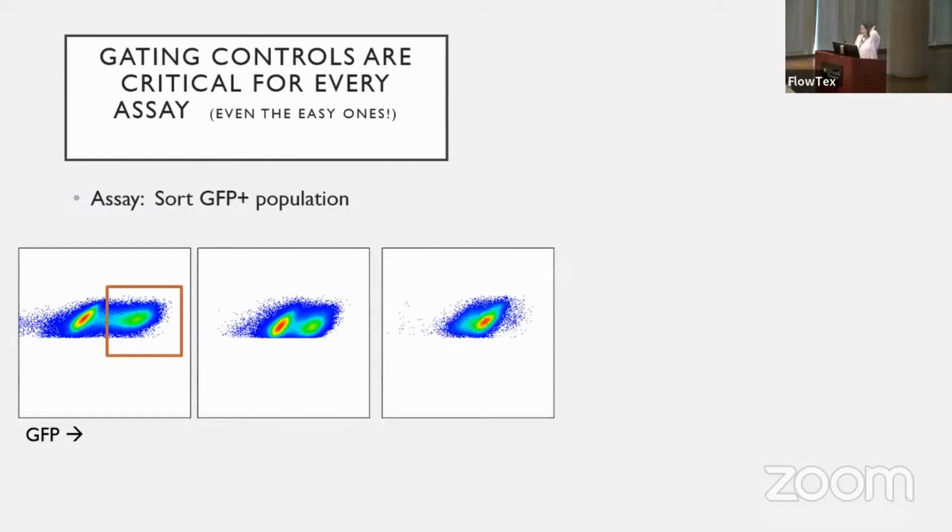How about this one? So now I'm starting to really think these are all supposed to be kind of the same. So I don't really know what to do at this point. I mean, are these really the negatives and the positives? Are they all positive? Here's the thing. This is your science experiment. You shouldn't be guessing, right? We should be making controls.